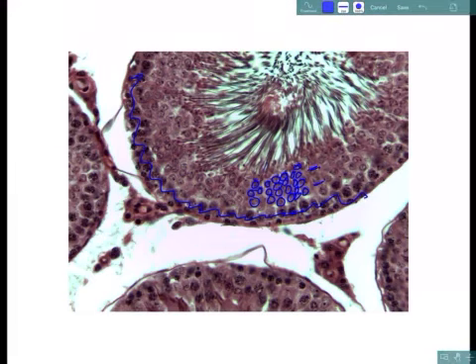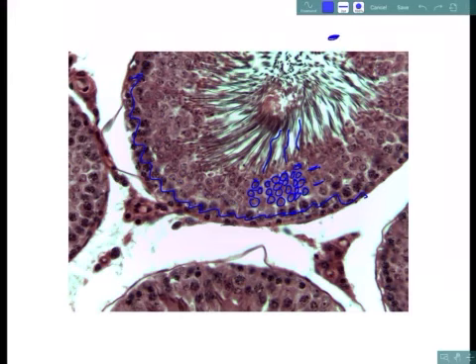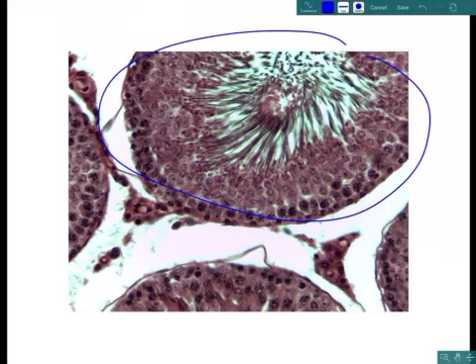And then what happens is a tail emerges at the lumen of this seminiferous tubule. So in the center there, we're going to see the sperm with a flat head. And then you're going to have our tail. That tail is known as a flagellum. It's our only example in the human body of a flagellum. You can find flagellum on other species like bacteria and protists. And so you can see these heads just starting to emerge here, and the cytoplasm from the cell that they once came from just kind of sloughs off. All right, so that is a seminiferous tubule.